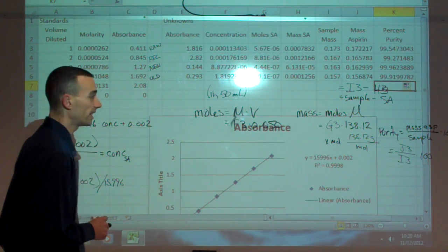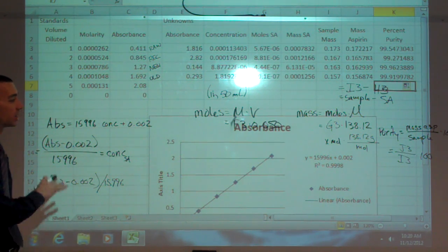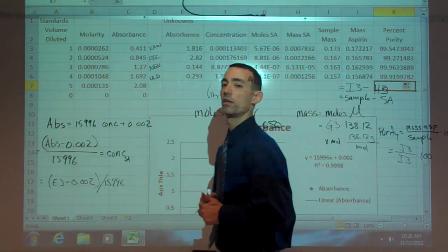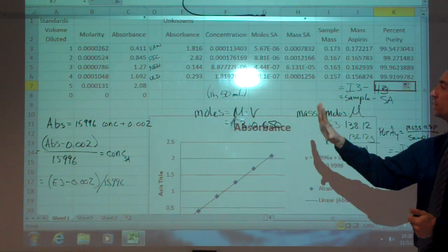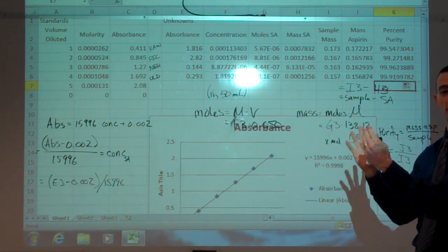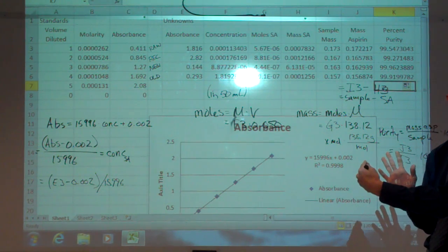Okay. At any rate, we've walked through all of the calculations now, and so we're done with all of the data. Now, the data template for this part of the experiment doesn't necessarily match this, but it would be totally fine if you went ahead and did this type of analysis and then cut and paste this from Excel into your final report.